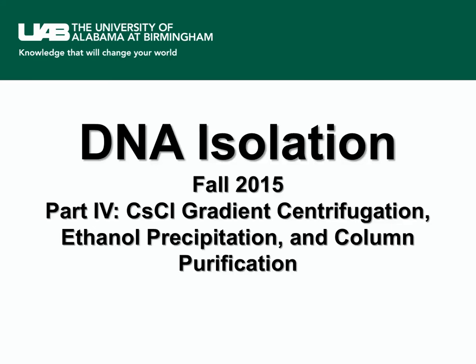And so the next lecture that we're going to have is part 4, and we're going to talk about, now that you have neutralized the lysate, now that you have extracted with the phenol chloroform isoamyl alcohol, then what do you do to purify the DNA?